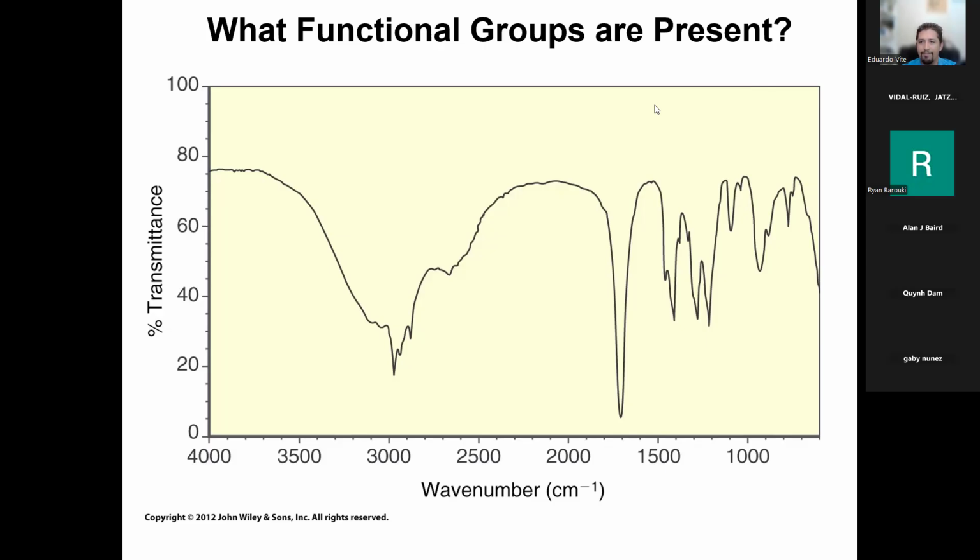Wrong. It's not carboxylic acid. A carboxylic acid is made of two things. You have to be specific. Annie said OH. Right. What is it actually called? Don't just say OH. It is OH, you're right. But what is it actually called? Let's practice names. Hydroxyl. This whole signal is your hydroxyl signal. Make sense? That's why you can't say carboxylic acid.